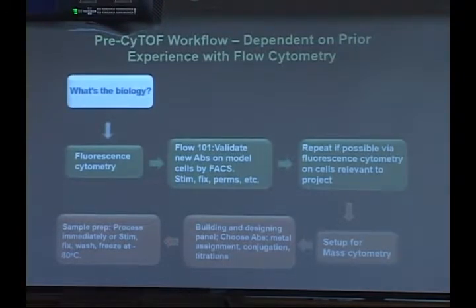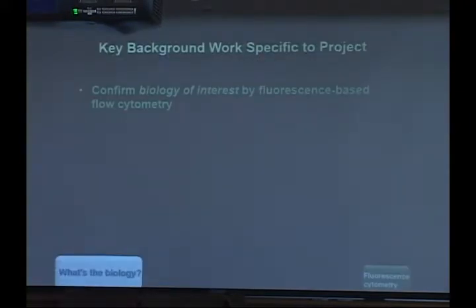Then, of course, there's ready for the sample prep. Then a number of places. This is where you could take a break. So you can actually do the whole thing and be totally exhausted, or you can do the stim, fix, wash out the paraformaldehyde, freeze at -80, and then run the samples after that, or ship to somebody who does have a site.